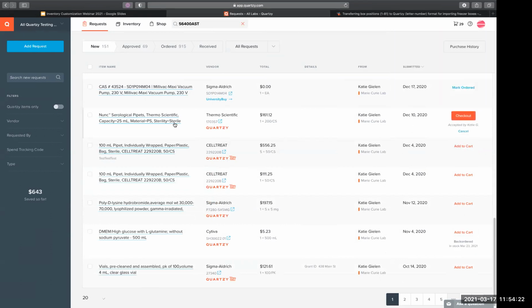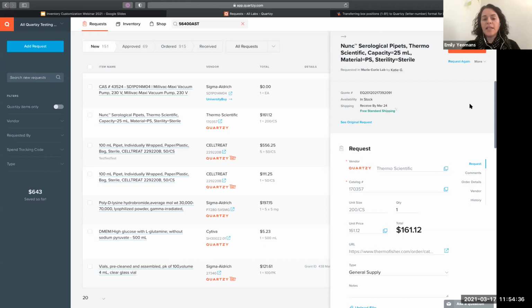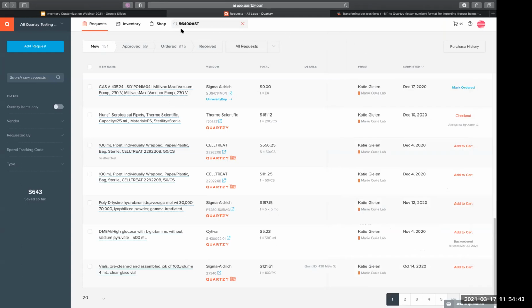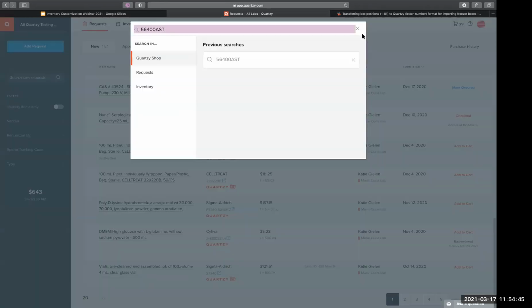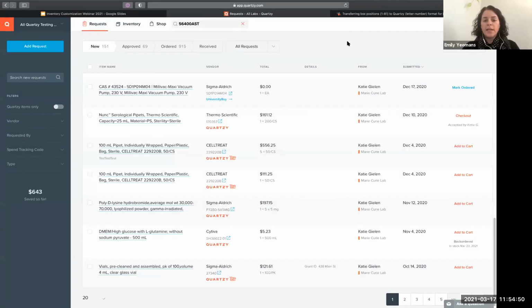And then Chloe will definitely be able to answer more about how equivalent matches are made. Her and another person on our life science product team are the ones that make those matches. A lot of times they're actually manually making those matches. Yes, they've manually made and looked at every single match, so it's definitely a vetted process. They're experts. They come from a science background and really know if it truly is a match or not.